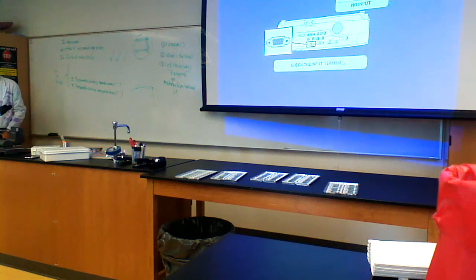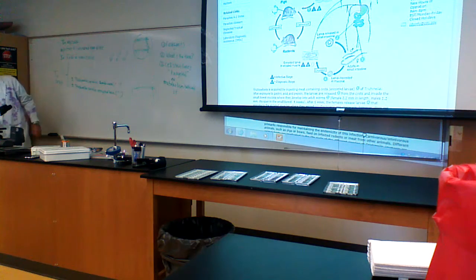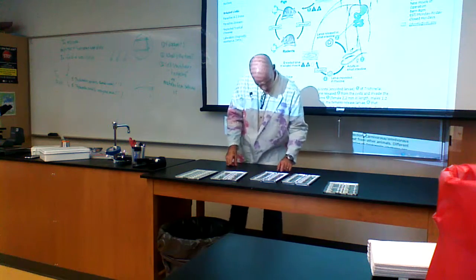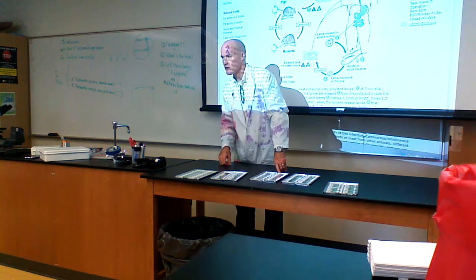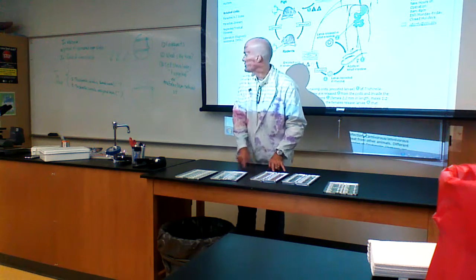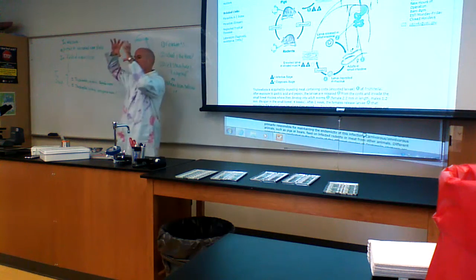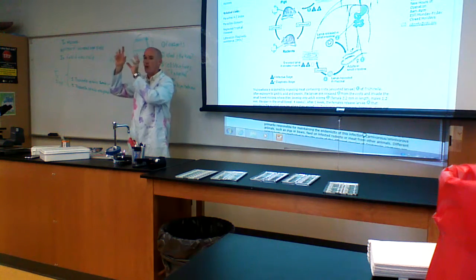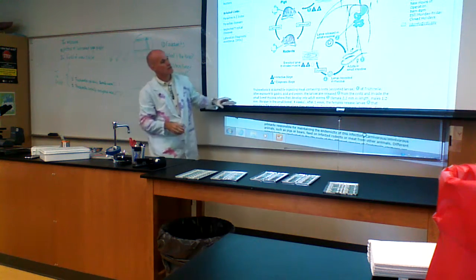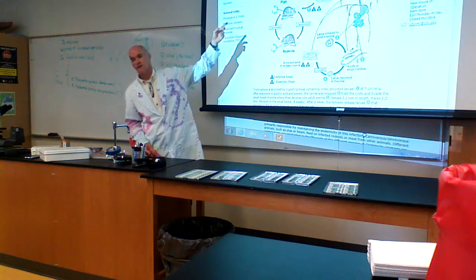So Trichinella. This is stuff that is not in the book, so you're not expected to know this, but I want you to appreciate what you're actually looking at. Up here we have Trichinella spiralis encysted larva and Trichinella spiralis female WM, which stands for whole mount. I want a drawing of both to scale. And when you draw the circle that you see, draw the organism relative to what you see, so it's the same size. The reason I'm doing this is Trichinella is something you get typically from eating pigs, although it's in a lot of other species.